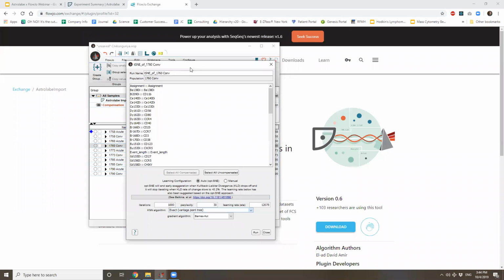The other is gradient descent. And so tSNE is an iteration from one step to the next. The rate at which you tune it can be calculated a number of ways. Barnes-Hut, which is the default, has always been the traditional. The fast Fourier transform uses some heavy math.